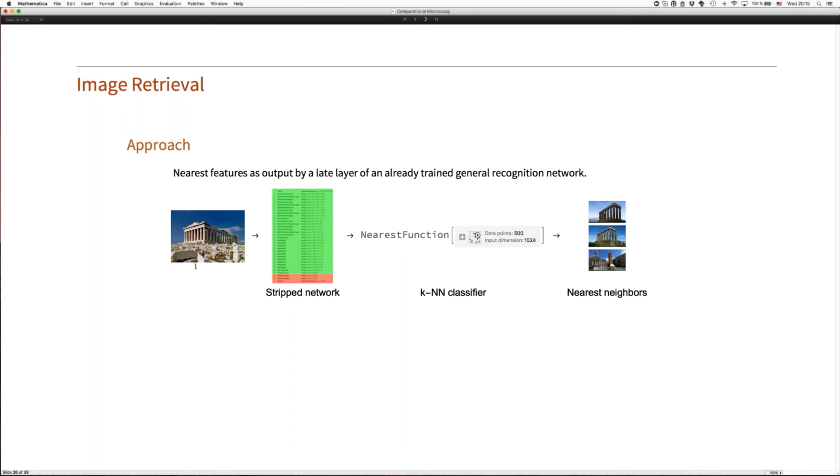You're given an image, you create features from that image, then you look in the feature space of your database. Is there any other feature vector that resembles it, that it's close? And if so, get the corresponding image, and that should, if everything is working correctly, should be an image that resembles the original. So without any tags, we should be able, with a neural network that generates these features, to obtain feature vectors in a data set and then retrieve the corresponding images.